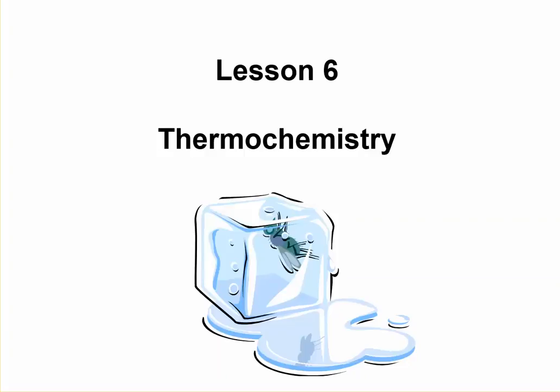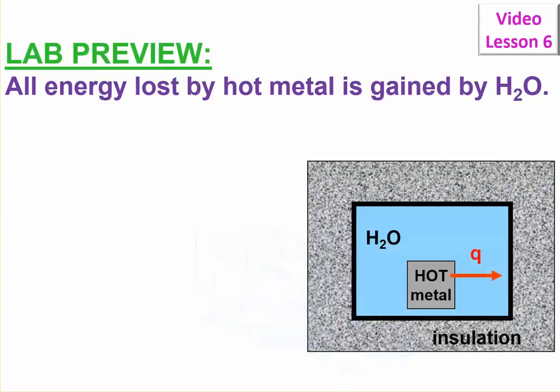Lesson 6 is on thermochemistry. This is the relationship between energy and matter. I always start this lesson by looking at the lab and what you're going to be doing in lab. So this lets you plunge into the subject before you get all the details of the background.